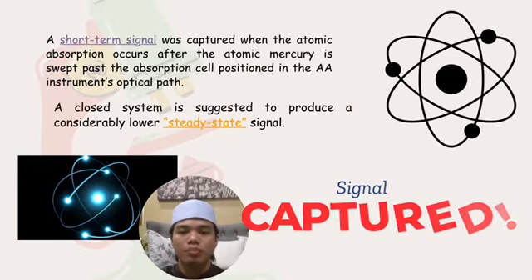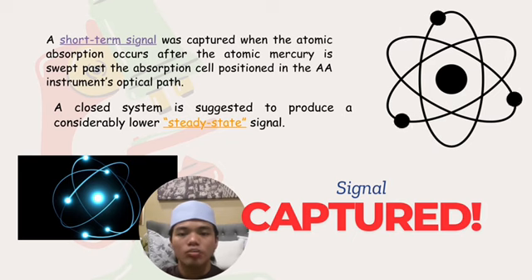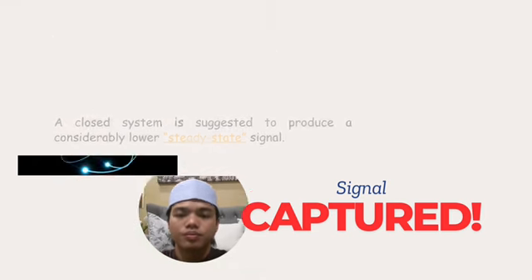Once the mercury passes through the detector, a short-term signal is captured, showing its presence. A closed system can produce a lower, steady-state signal. With its reliability and effectiveness, CVAAS remains a key technique for mercury analysis. Thank you, and I will pass to the next presenter.